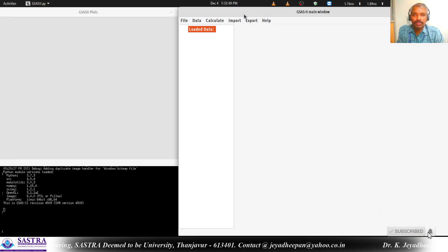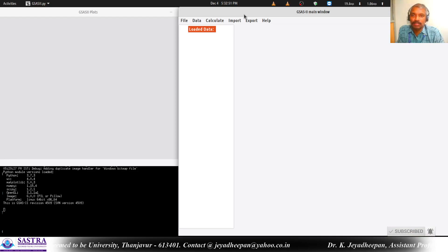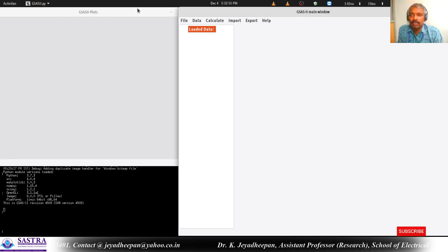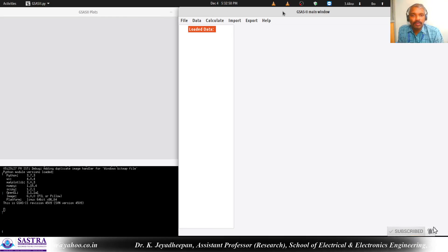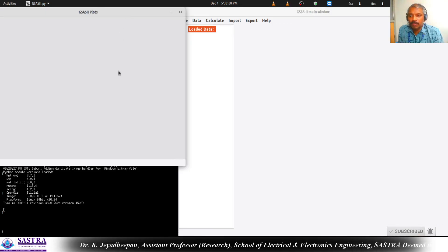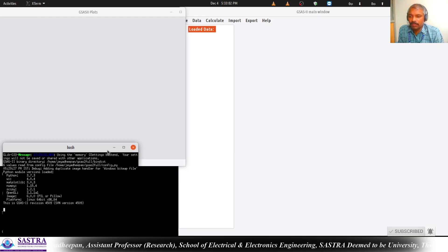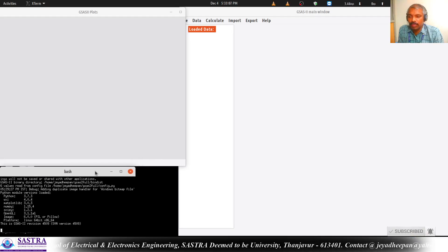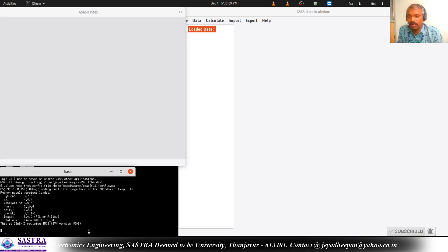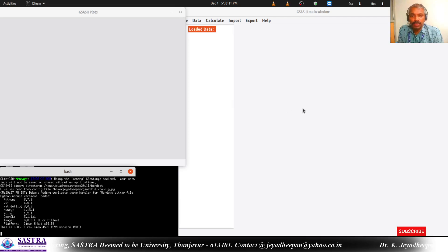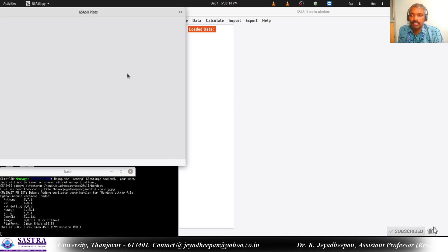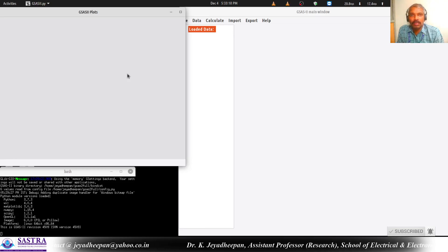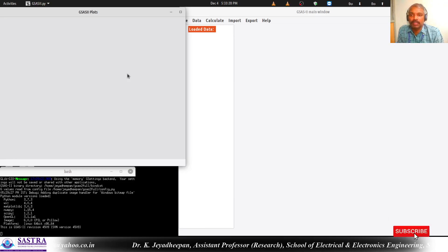We are going to use the software called GSaaS2. Whenever you open this GSaaS2 software, it will show you three windows: one is the main screen window, another one is the plot window, and another one is the bash window. The bash window we will not be using for any purpose - only for some information purposes. This is the complete GUI window and it is going to be used to visualize and work with the X-ray diffraction plots.